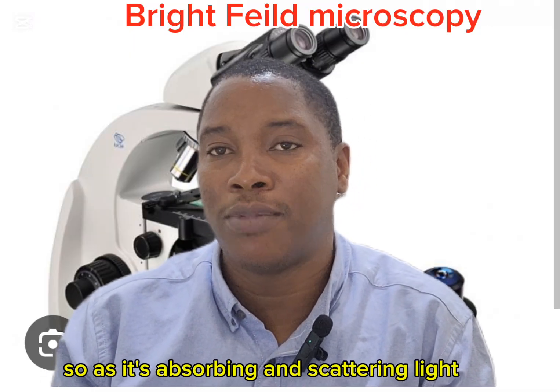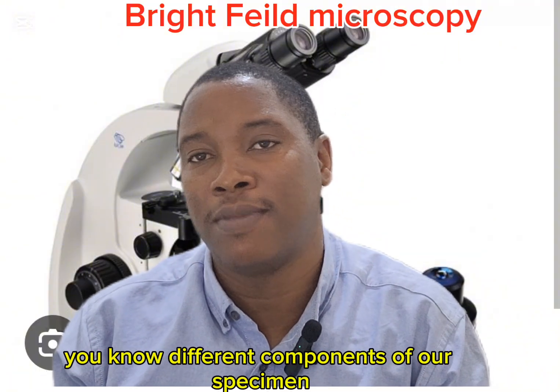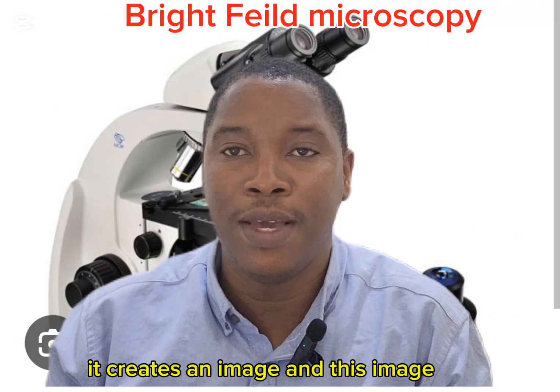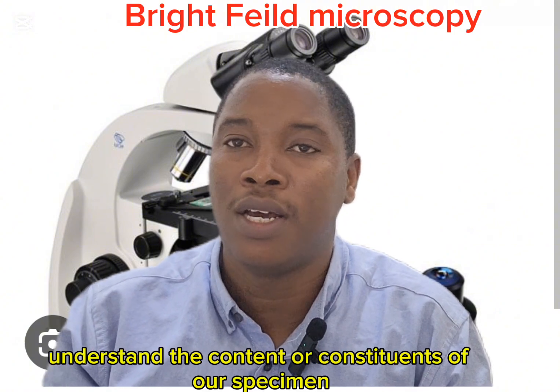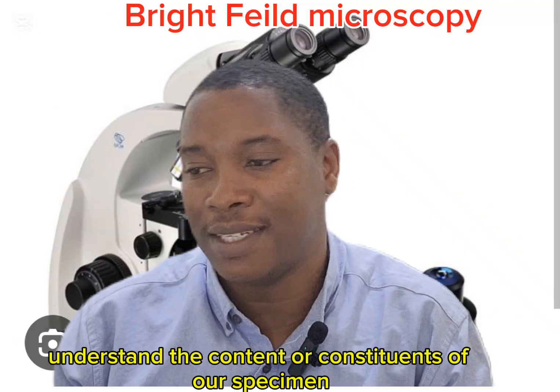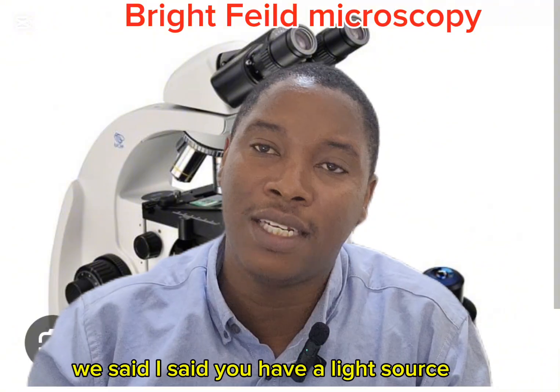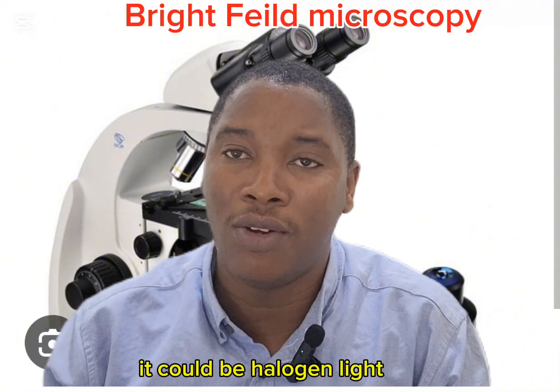As different components of our specimen absorb and scatter light at different paces and abilities, it creates an image. And when we view this image, we're able to understand the constituents of our specimens. This is quite important for us to know. Now, like I said before, you have a light source. The light source could be LED light, it could be halogen light.